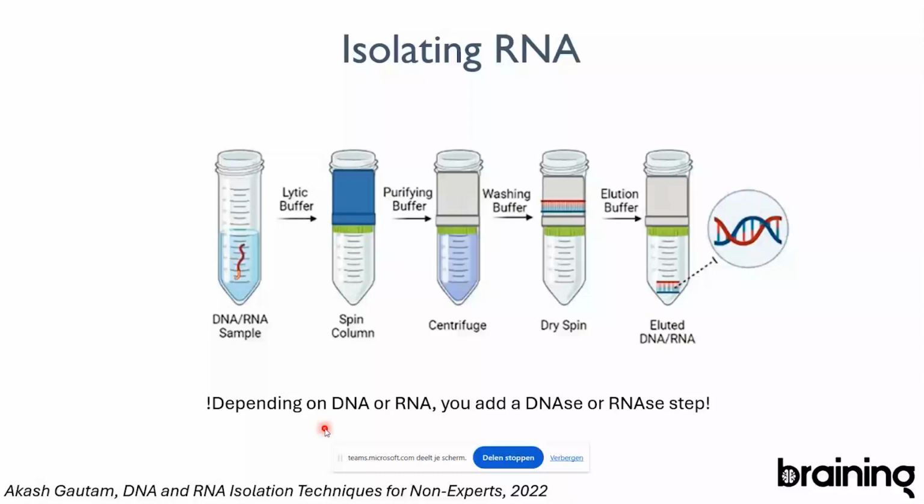Depending on whether you want to keep DNA or RNA, you add a DNase step or an RNase step. If you want to keep the RNA, you get rid of the DNA using a DNase, and otherwise you use an RNase to get rid of the RNA. Okay, so isolating RNA is a very classic way.